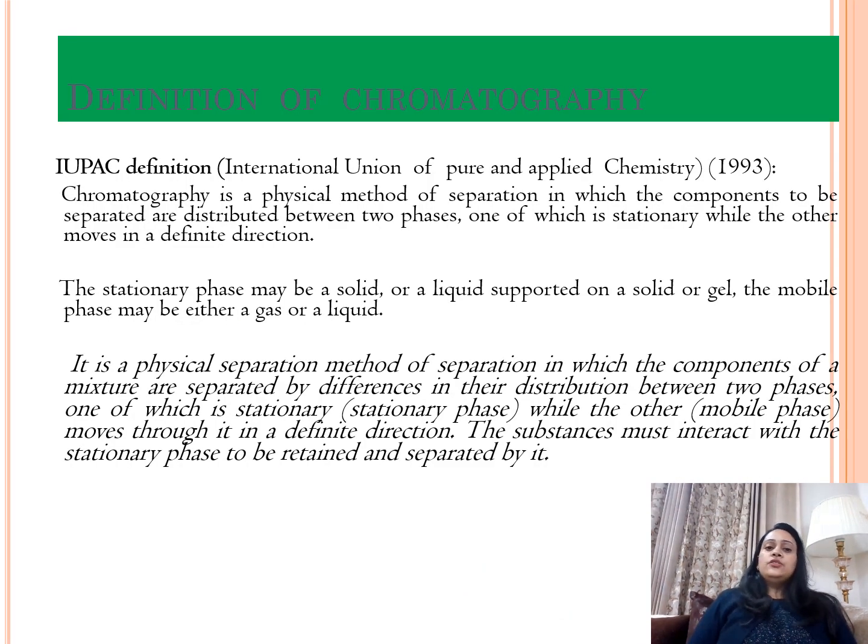There are various definitions of chromatography. Basically, according to the IUPAC definition, it is a physical method of separation where the components we are separating are distributed between two phases. One is the stationary phase and the other is the mobile phase. So you have two phases, mobile phase and stationary phase.